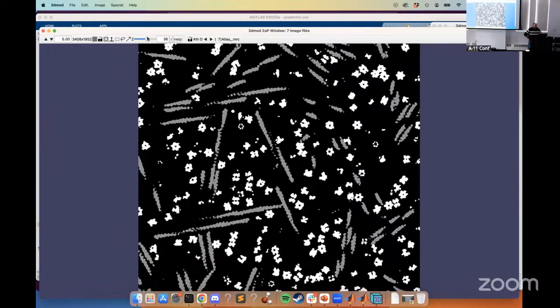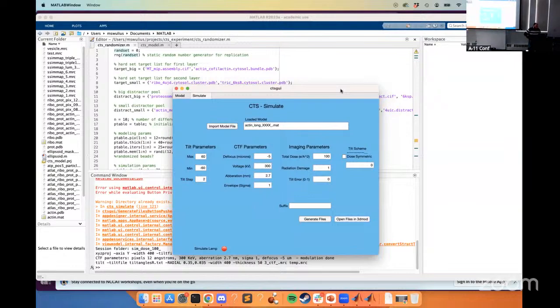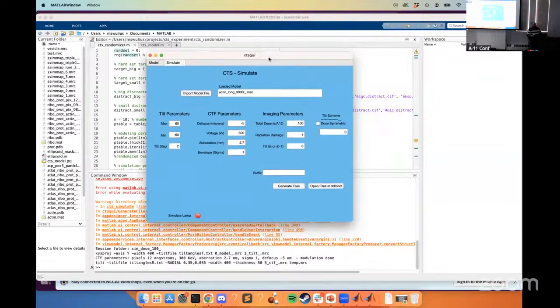This is the ground truth that you can import into Dragonfly and extract the regions of interest in. All right, so I can do more with CTS. Not sure what else you'd like to see. For creating the denoise, I think basically you already. Oh, yeah. Sorry. Good point. You just make the settings impossibly good. Yeah, we'll give you that.